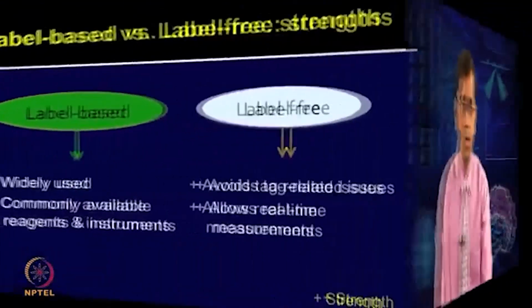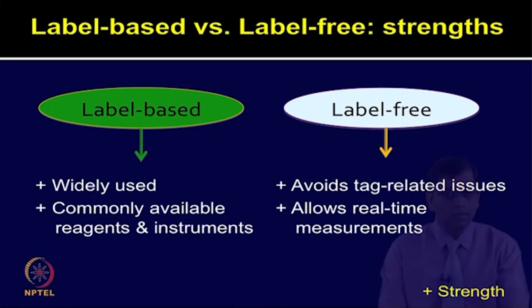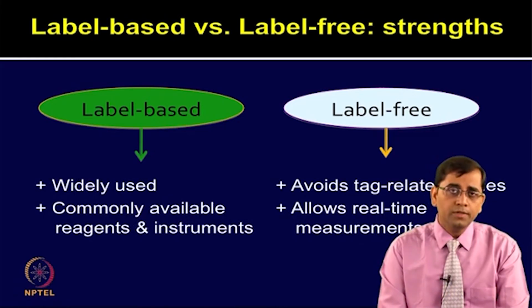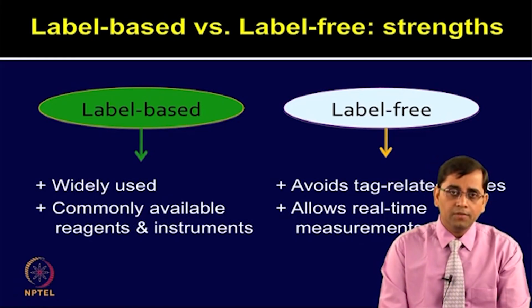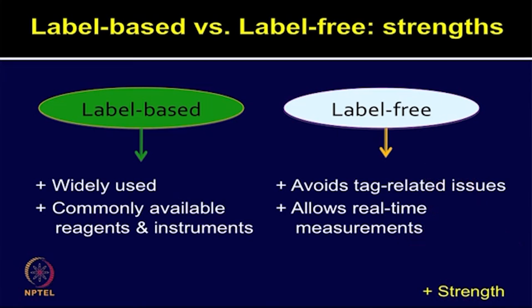Label-based methods are commonly used in most of the laboratories worldwide. Therefore, most of the reagents are very easily available and so is the instrumentation. However, the label-free methods are mostly new and modern, so the instrumentation is still very costly and not so easily accessible.